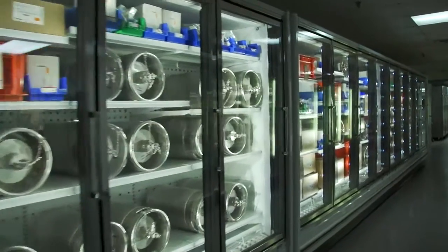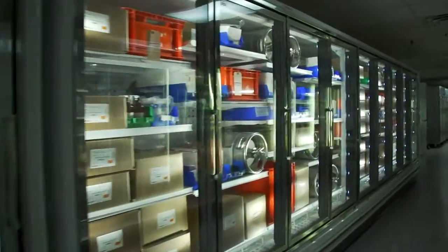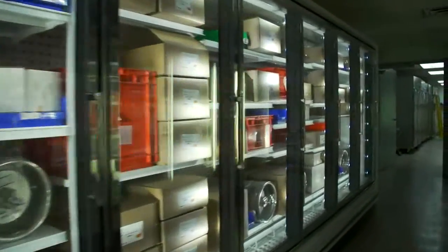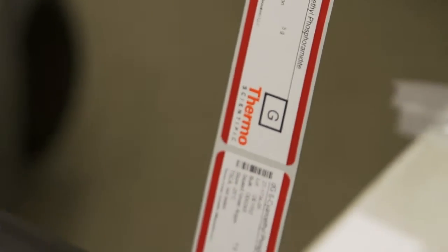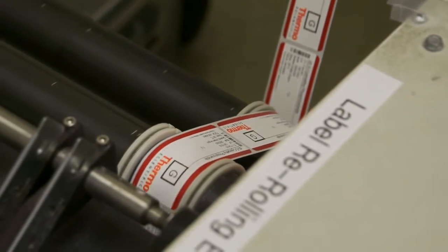It even extends to logistics, where 24-hour temperature-monitored freezers ensure product safety and integrity, and advanced systems mean exceptional delivery performance in a high product mix environment.